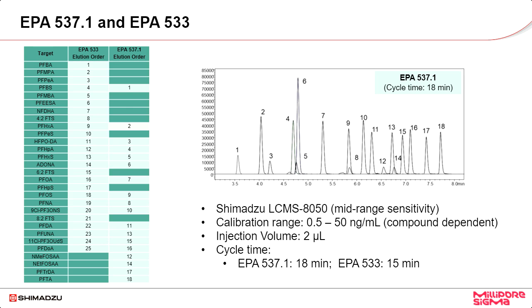So we built that extra rinsing time to make sure that there is no carryover. The work I'm presenting today was done with an LC-MS 8050. That's a mid-range instrument in terms of sensitivity. We have other models that are a little bit lower sensitivity and much higher sensitivity.